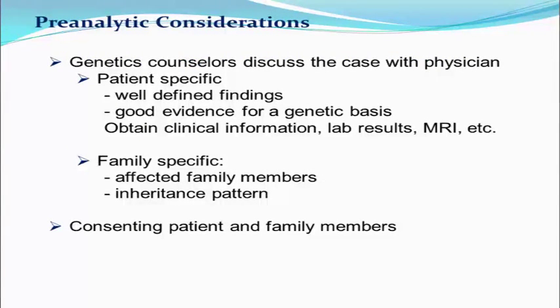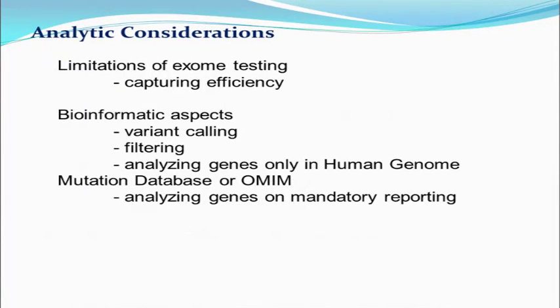And exome sequencing is a really evolving process. It involves lots of communication between the laboratories and the physicians. Once the testing has been ordered, our genetic counselor starts discussing the cases with the physician to obtain the clinical phenotypes, the laboratory testing results, and family histories of the conditions. All of this information helps with the future data analysis, and also helps the physician in consenting the patients and their family members.